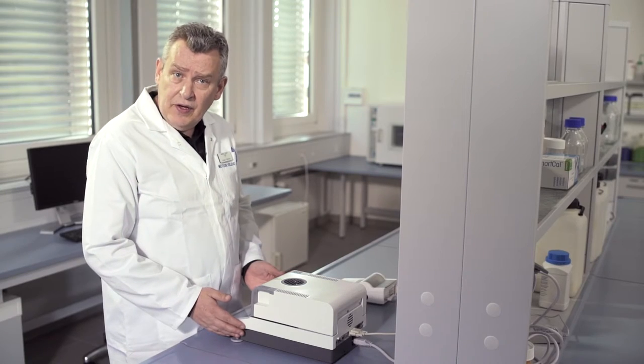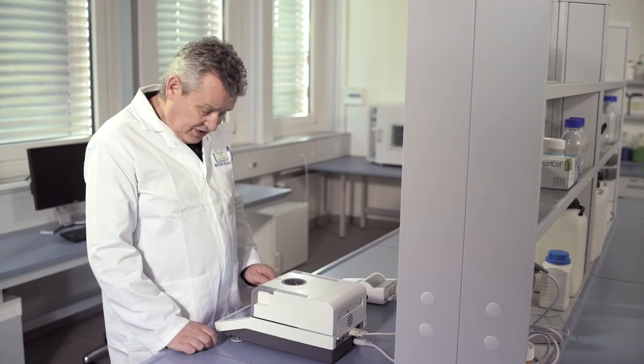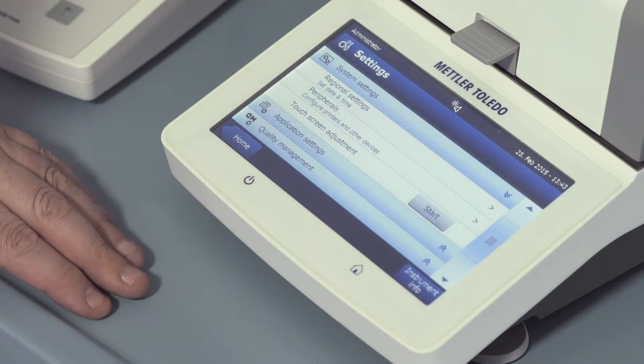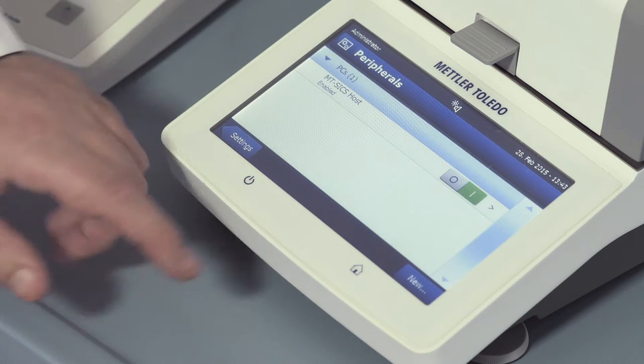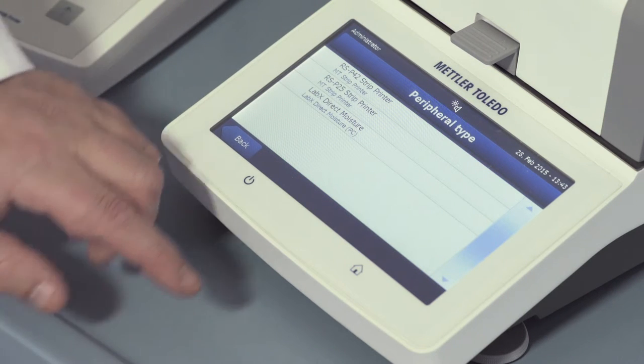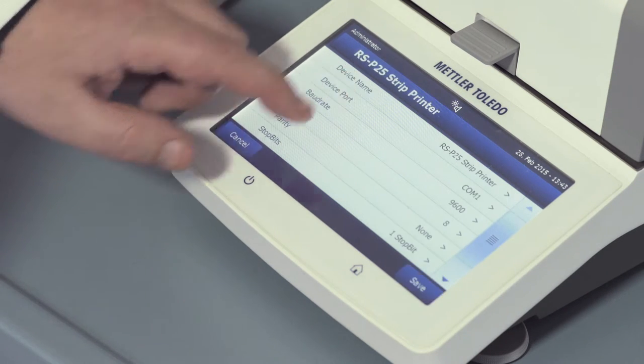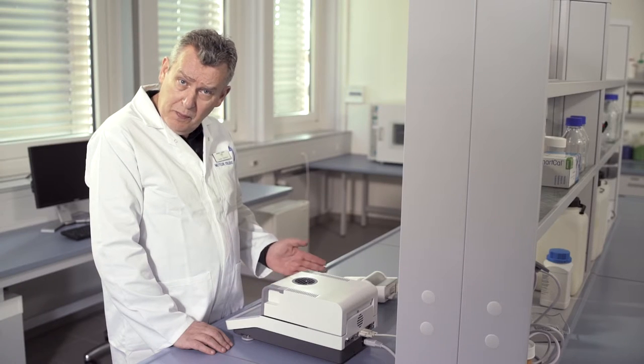To add a printer, enter the settings menu, system settings, peripherals, new, and select the RSP25 strip printer. This printer automatically detects the RS232 settings.